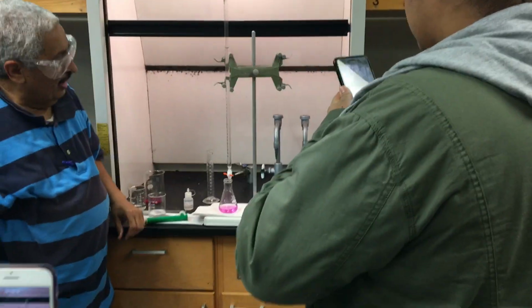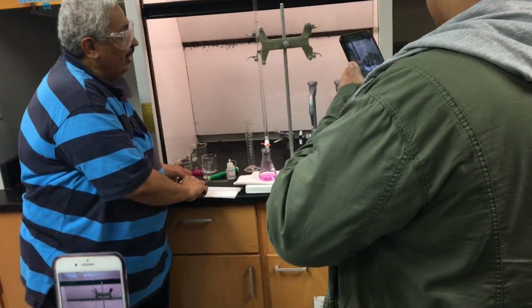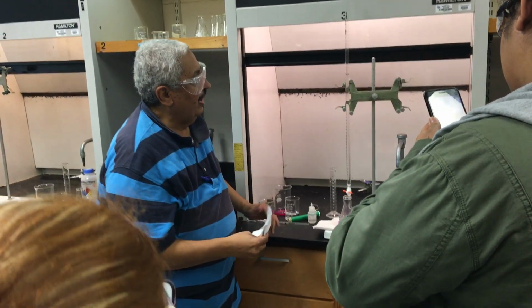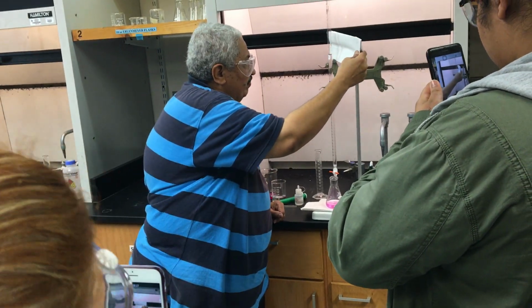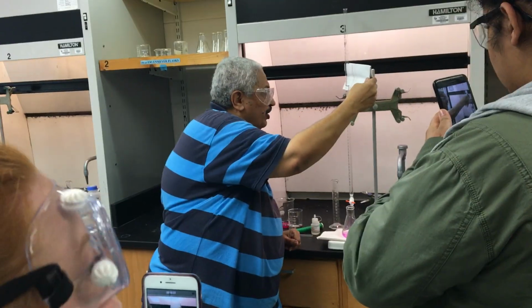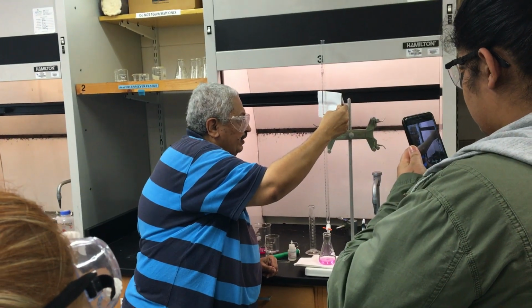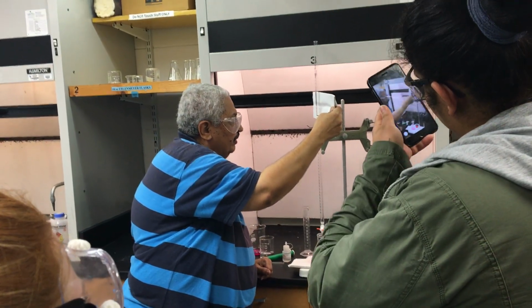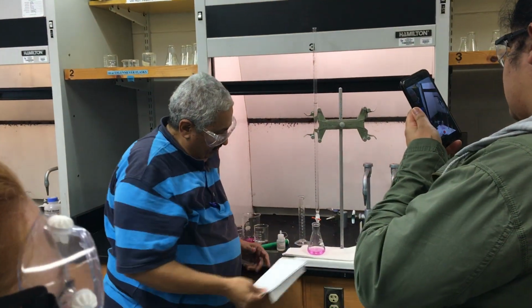So I come here and look at the bottom of the meniscus here and record the value. So I'll take a little bit up here. It says 17.3. I'll take 17.25. Correct? 17.25.